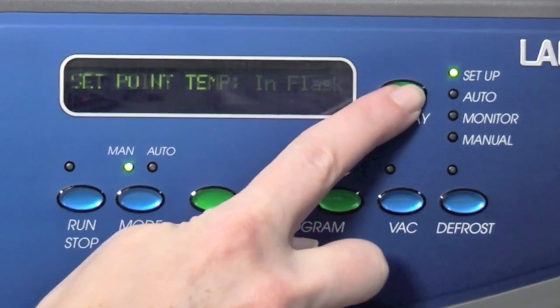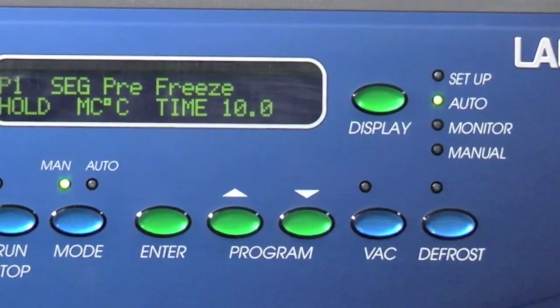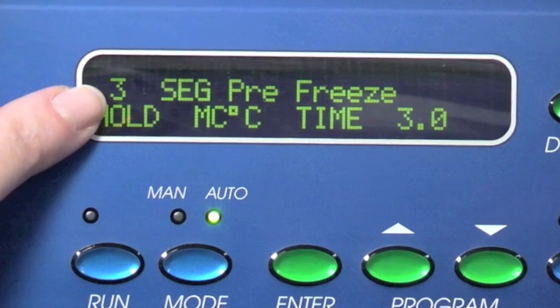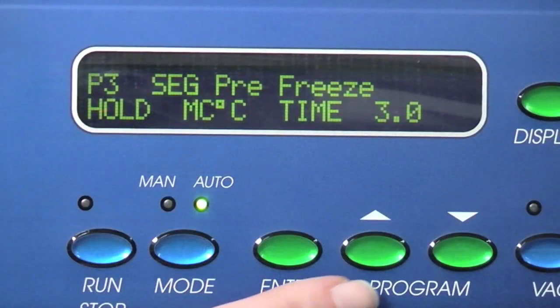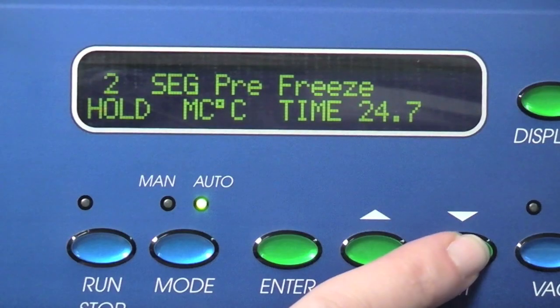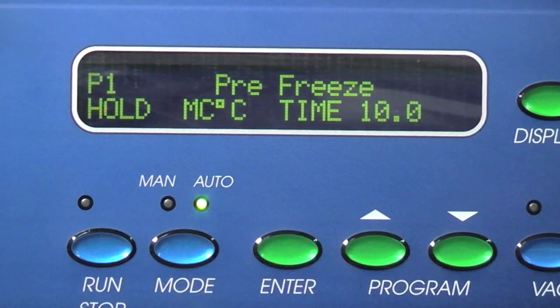Press the display button until the auto indicator is lit. The P in the display will flash and the program number that will be run is shown. To select different programs, press the up or down button to change the program number. When the desired program number is displayed, press enter.